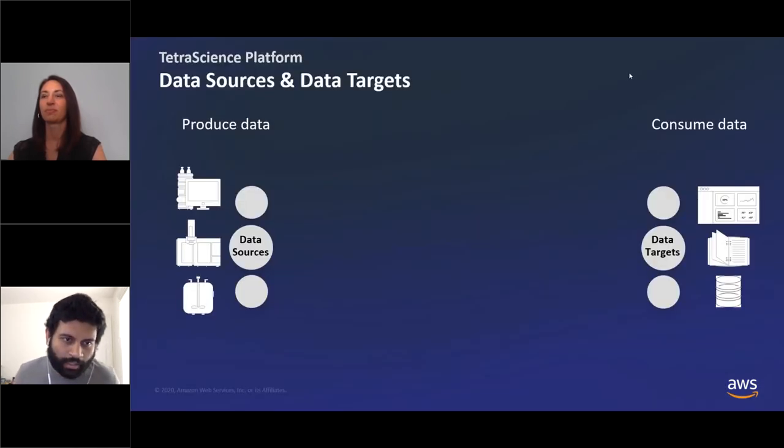So if you could move forward. Just to quickly recap what Rachel said, we think of the lab as consisting of data producers and data consumers. Sources might include lab instruments of varying sophistication, going all the way from your mass balance all the way to an HPLC, a sophisticated instrument with a supporting data system, a Windows computer attached to the instrument, or it could be something outside the lab, like a contract research organization.